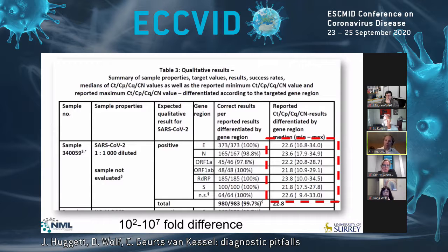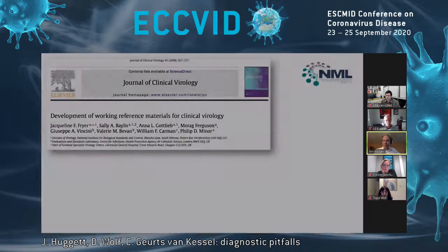That's not considering any sampling, storage, transport. That is that stage 2 that I talked about, the sample processing, the RNA reverse transcription, and the actual molecular detection. And so we're getting between 100 and 10 million fold. Well, perhaps 10 million fold is an extreme, and I think there may be preamplification in there, but certainly 100, 1,000, this is normal. And the fact is it's not new. We've known this for over 12 years.